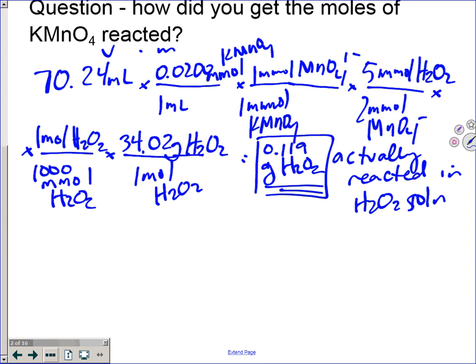So you didn't mass your initial solution of hydrogen peroxide. Wait, what was y'all's initial for this trial of the hydrogen peroxide? Be louder for me. 1.02, so initial volume 1.02 milliliters. I need your hydrogen peroxide initial volume. You used 1 milliliter, so 1.02 or just 1? Just 1 milliliter. Is that what you said? Okay.